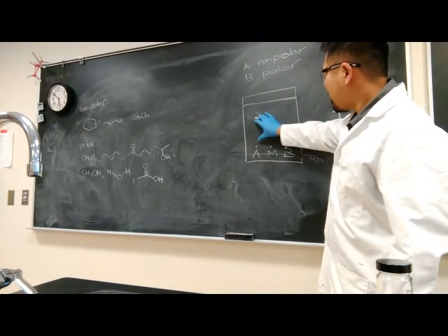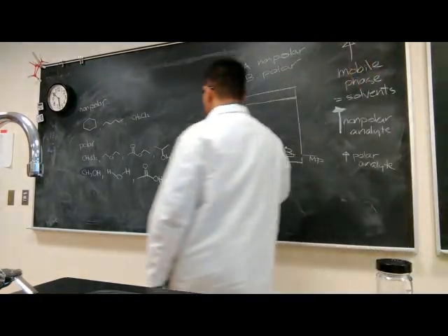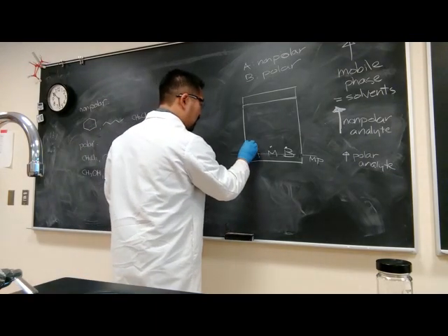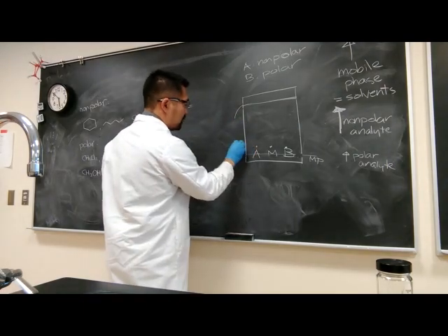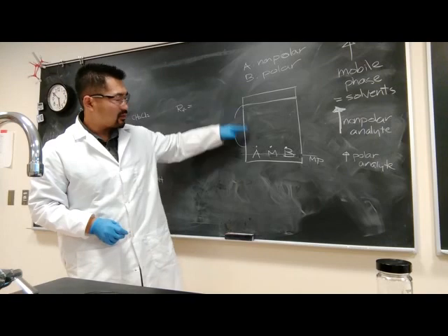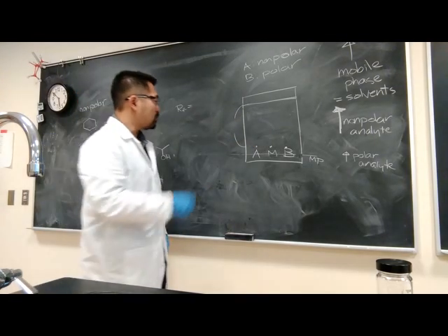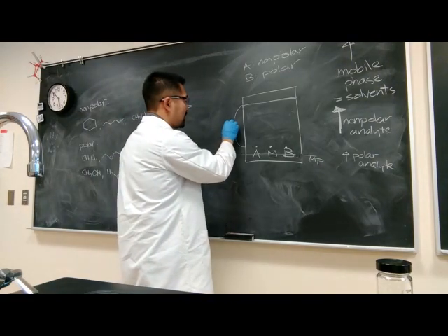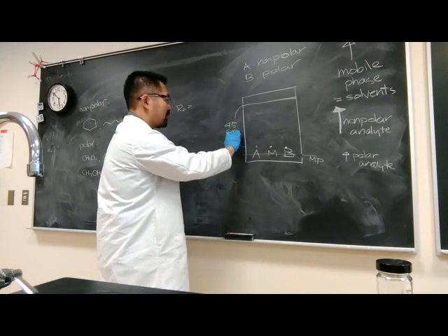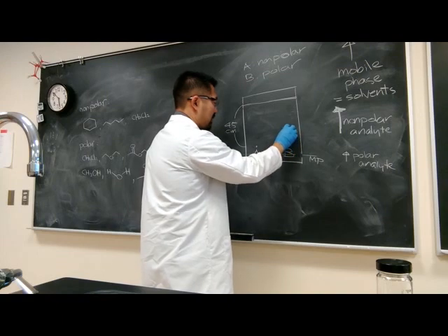And to talk about where the sample spot appears on the TLC plate, it might be good to talk about the RF value, which is already defined for you in the lab manual. But you will want to take the distance that the solvent traveled from the origin sample dot. So you will actually want to take a ruler, and let's say that this distance comes out to be 4.5 centimeters.